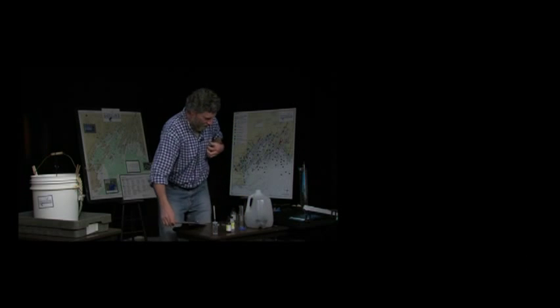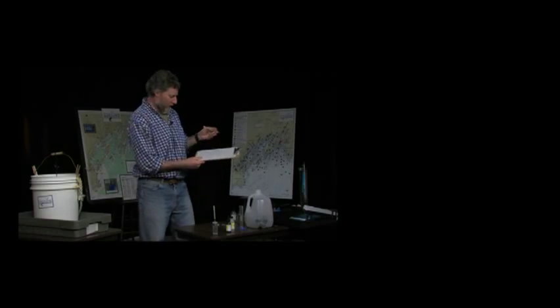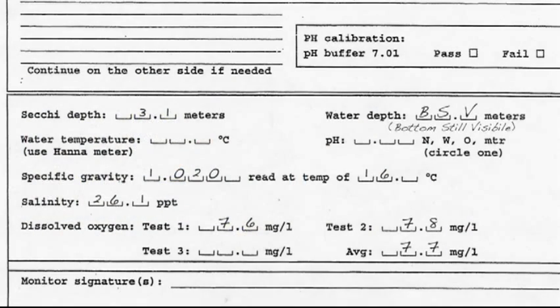On our data sheet, we will write down what our results were. We had 7.6 for the first one. We had 7.8 for the second one. On the data sheet, it also asks for our average. The average between these two would be 7.7, so we'll write that down.